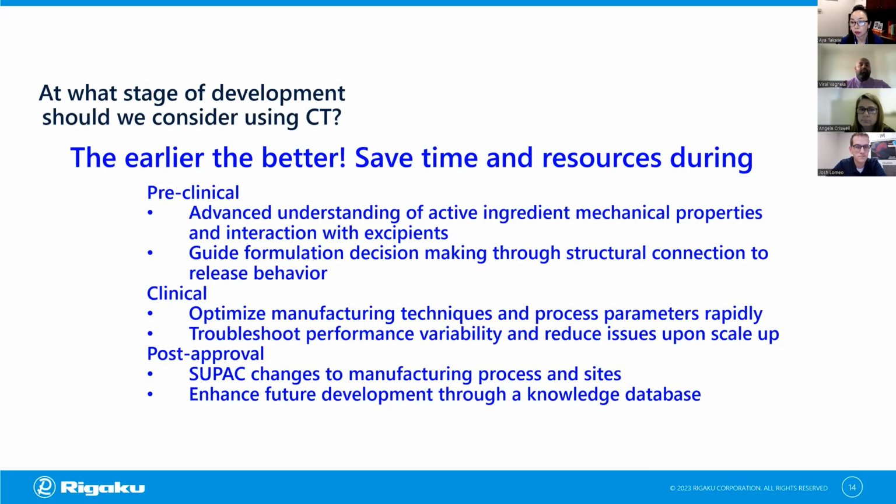I think that was a previous question from a couple of questions ago that you just answered, but just curious, how does CT complement other analytical techniques that are used in various developmental stages? Yeah, overall, it's quite orthogonal. I would say that there are always going to be those more routine measurements that are based on their speed. But the beauty of CT comes in the ability to really get a three-dimensional and non-invasive inspection of these.